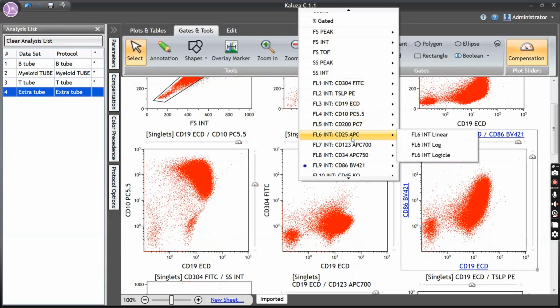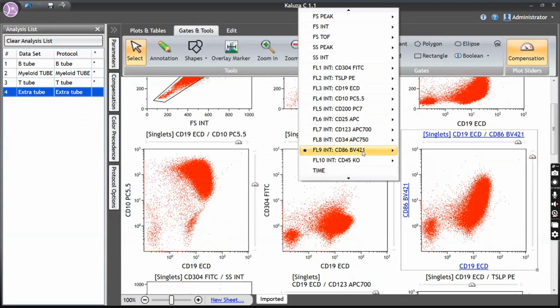I'm using CD25 for detecting Ph positive ALL. I'm using CD86 as an MRD marker, CD123 as an MRD marker. So instead of just using CD58, CD73, CD38 as we saw, I'm using some other specific markers which will help me to give the LAIP, or the signature of the leukemic blast. During MRD tracking, these markers will help me pick up the disease.